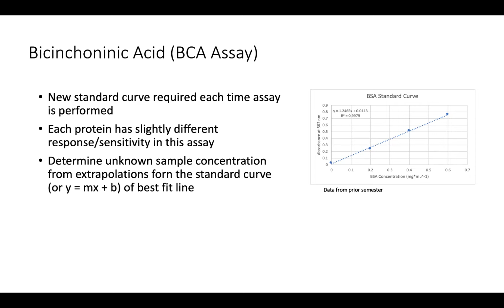You will be doing replicate measurements. The idea behind the replicate for our standard curve is to understand outliers and to be able to remove any of those outliers and also get a nice average. When you start running the activity assay, it is time critical in getting the sample into the spectrometer.